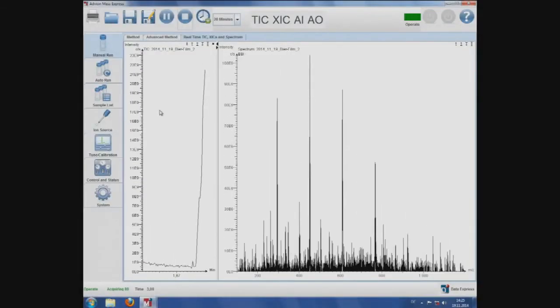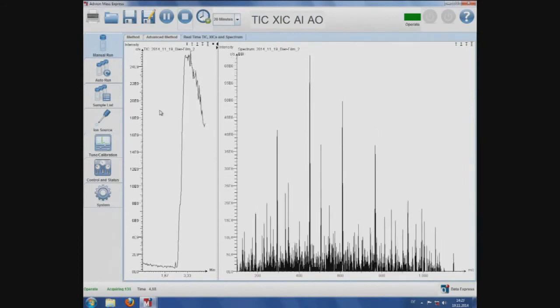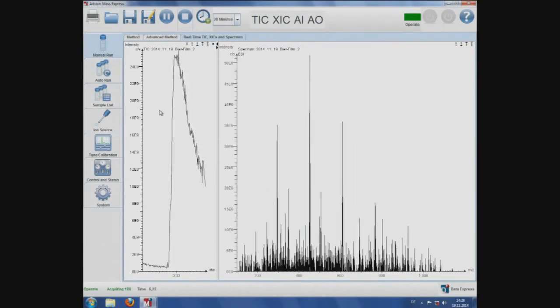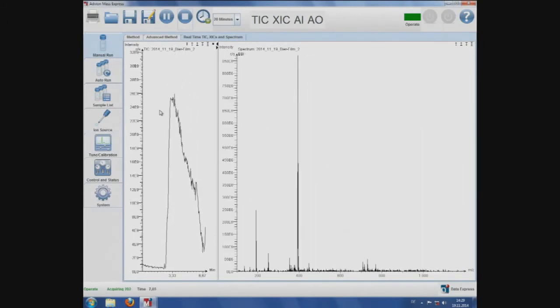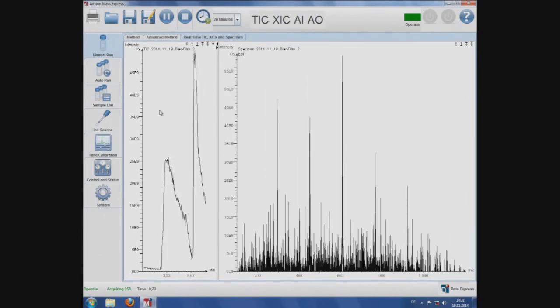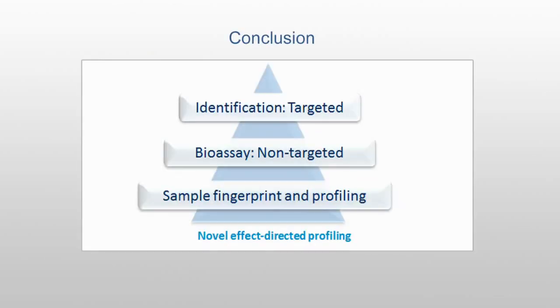The software Advion Mass Express recorded the elution chronogram in the negative ion mode, first of the blank at around 3 minutes, then of the estrogen effective zone at approximately 7 minutes. The respective mass spectrum of the estrogen effective zone was extracted. The respective mass signals were clearly visible at mass-to-charge ratio for the deprotonated molecule. The imprint of the oval elution head was visible after the elution.